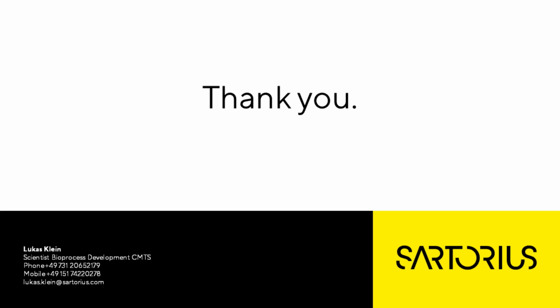So actually the sensor regeneration capability, first of all, reduces the costs. These sensors you can regenerate and use for 9 different times. So in a plate you have a row of 9 samples, and you can dip one sensor 9 times into one well, with analyzing and regeneration, and after that you can go into the next well. This is actually the main benefit for it. So this is quite good.